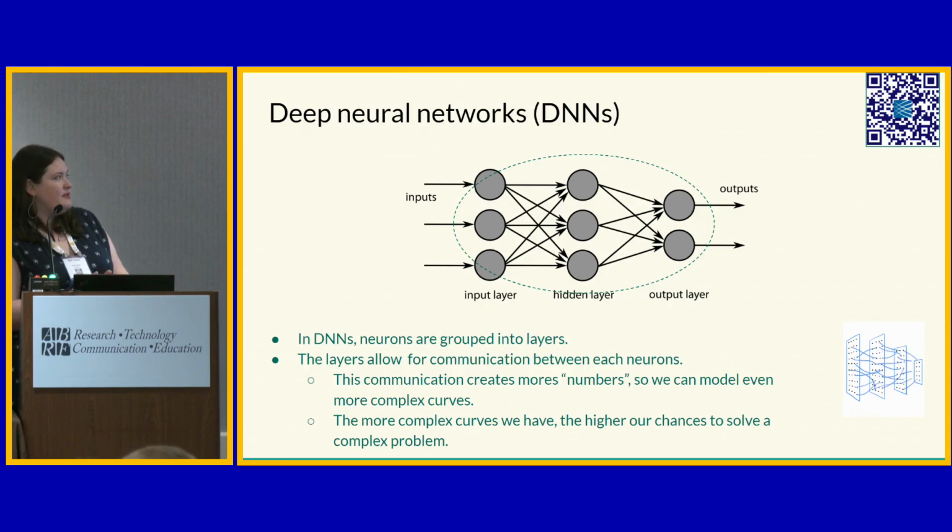Again, deep learning, we're typically talking about something that's a neural network. So we have inputs that go into layers. Layers, we sometimes talk about feature layers. They're connected to each other. I'm going to show you a video of this in a second, so don't freak out. But we are connecting all of these individual neurons, which again we sometimes call features, with weights.